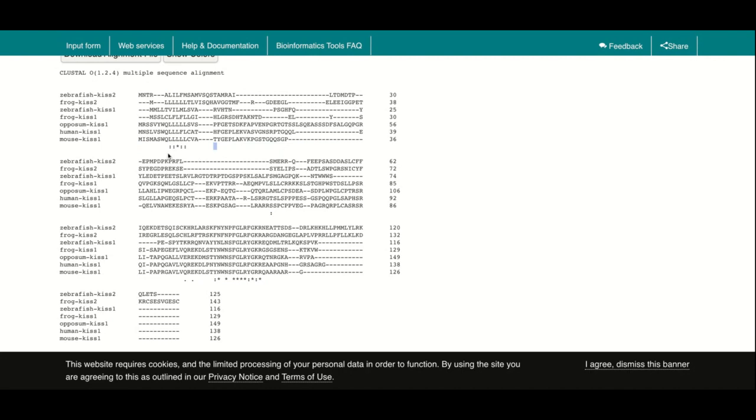Then if you compare over here, what are the two dots? You have the L and V, and you look at the amino acid table to see how similar those amino acids are. So I is isoleucine and L is leucine.